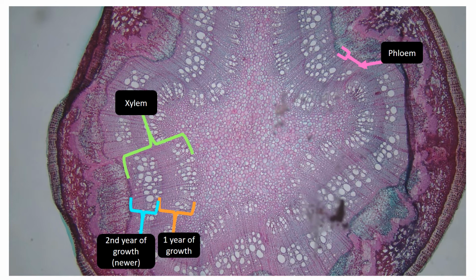You could probably stretch that out a bit with all that green, but I just want to hit that area. That's the phloem. And let's go zoom closer. Here we go. So this is a zoomed in version of what we were just looking at a second ago. On the left side of your screen is the more interior part of the plant. To the right side is the more exterior.